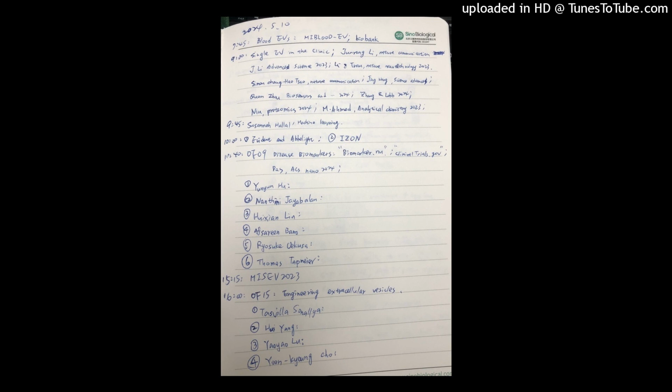So for some of these smaller scale experiments where we get huge amounts of data, it might be worth considering incorporating marker proteins and ratios, which is what we're starting to look at now. So we get a really good purity indication of, yeah, there's still a heap of lipoprotein in there, but we can reduce intrasample ratios to EV markers.